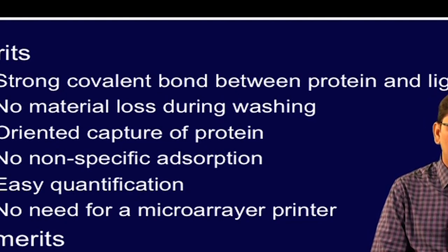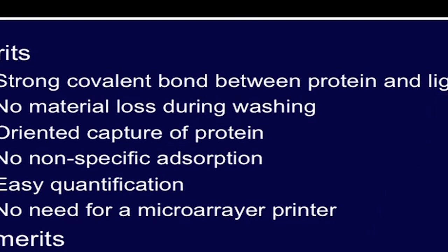However, there are certain limitations of using Halotag arrays. It has not been shown that the system can be used for high density arrays. Also, only a few spots using the commercial gaskets have been shown. So, applicability of this technology for high density protein microarrays is yet to be seen. High density arrays in theory are possible, but one needs to ensure that even at high density these arrays function properly. Then there is a possibility of loss of function on binding to the Halotag. These types of quality control checks have already been performed, but more biological questions need to be addressed on these arrays before confidently applying this technology for clinical applications.